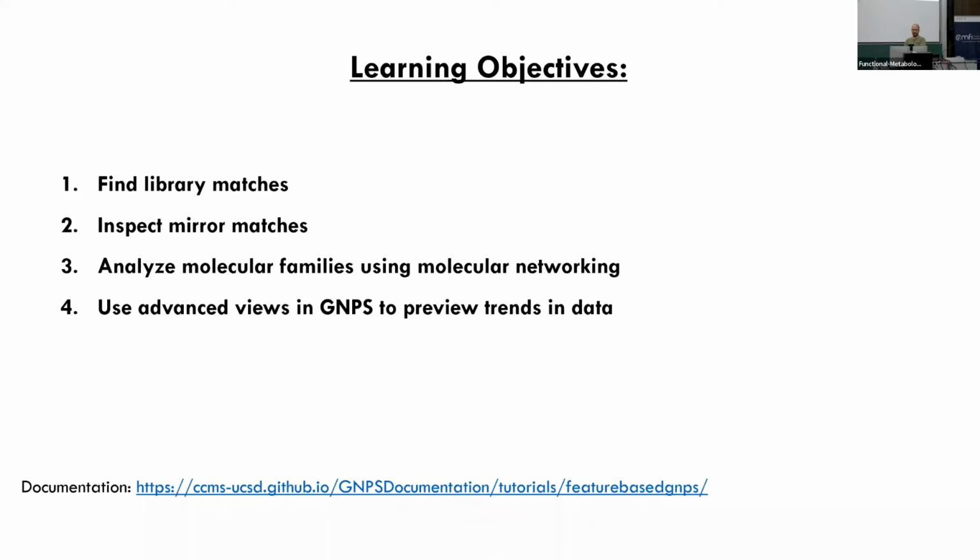One important thing: there's this link down here, which we can also paste in our resources document. There's extensive documentation for GNPS. We put a lot of effort into making written documentation under this link, and it also includes a lot of videos and recordings of past workshops we did. So there are quite a ton of resources online.